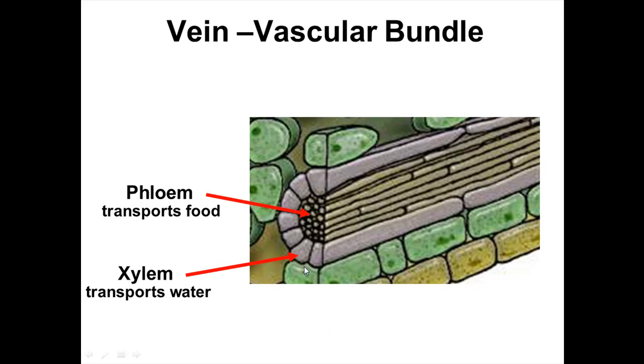If you saw this diagram under the microscope, you might assume these ones around the outside are bundle sheath cells. But we'll look at a few actual examples. The main thing is to note you'll see them in a little bundle, and your phloem are usually smaller than your xylem. They're generally pretty easy to pick out.